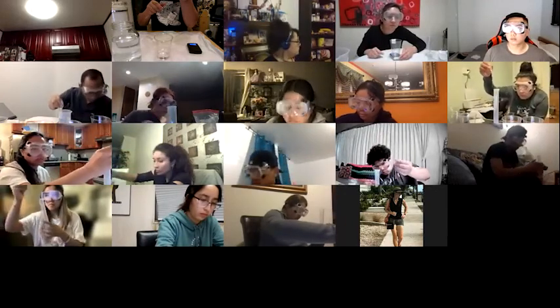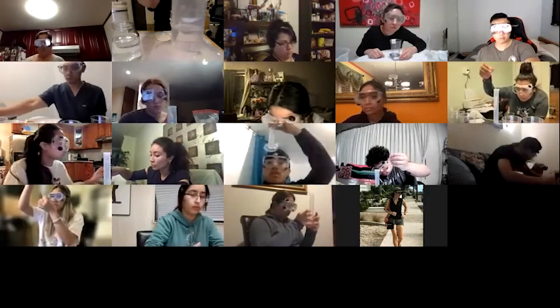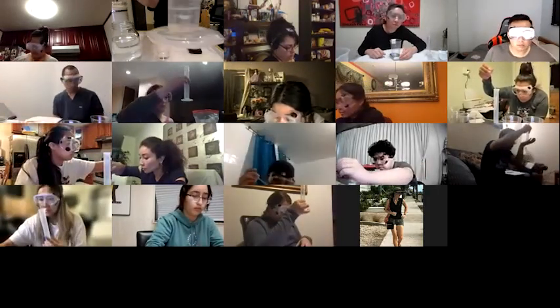That looks pretty close. So that's pretty close to 5. I don't think I'm going to get it much closer than that.